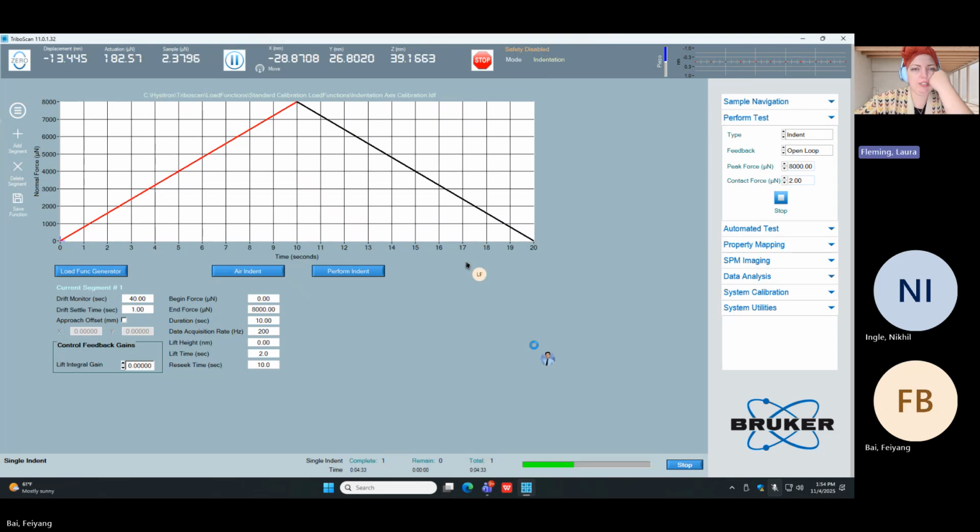And then it's going to move up to the Z fly height again before moving in X and Y to bring the optics back over the sample. And then it'll move down in Z to bring it into focus.